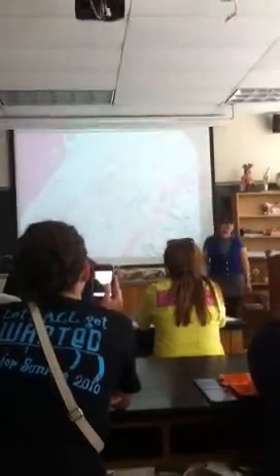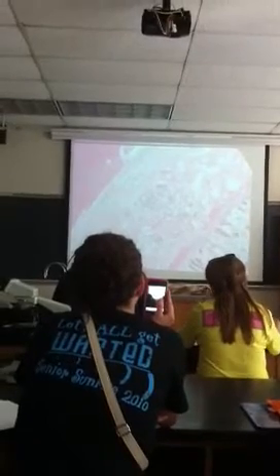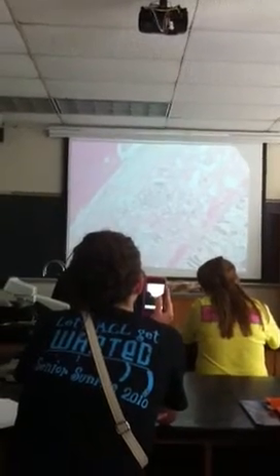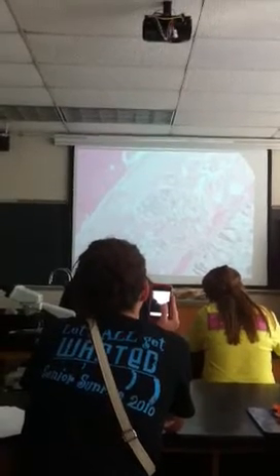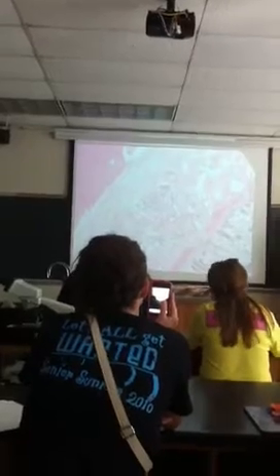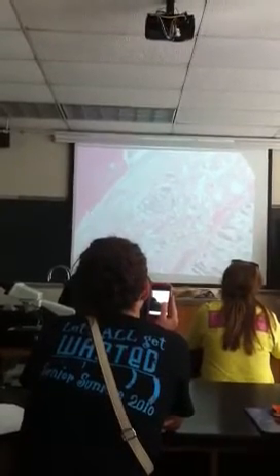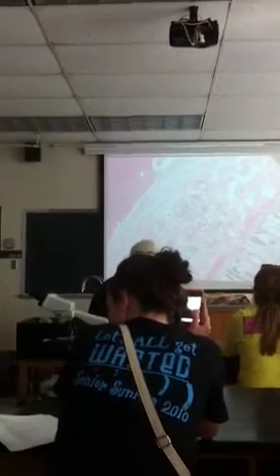These right here are called the Brunner's glands. Like I said, you only find them in the submucosa of the duodenum. And they produce an alkaline substance that's released into the chyme as it enters the duodenum to make the pH less acidic, so you're not singeing the inside of the small intestine. So if you see these in the submucosa, you know it's a duodenum.